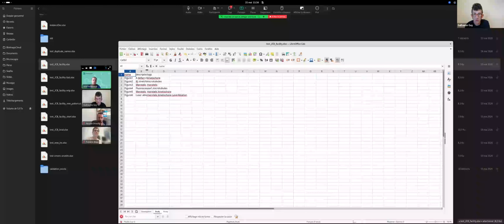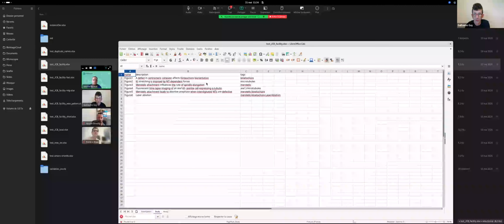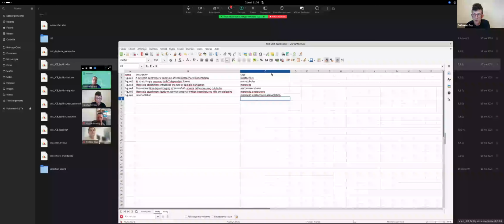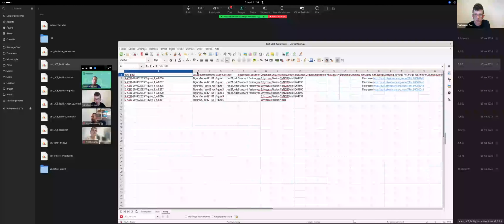The study is also quite thin in its description. It's a description, a name for the study, and some tags that will get into OMERO. Maybe later on, the sample information will be there. This is subject to change this year as we fit more the metadata standards or the user's workflows. But basically, the study doesn't have to be very detailed.